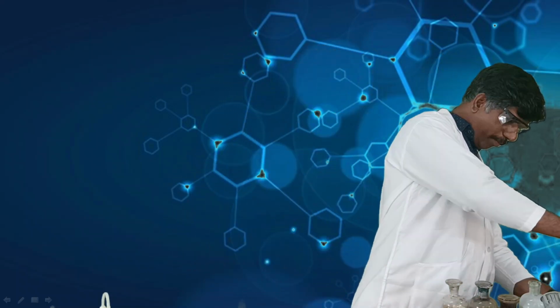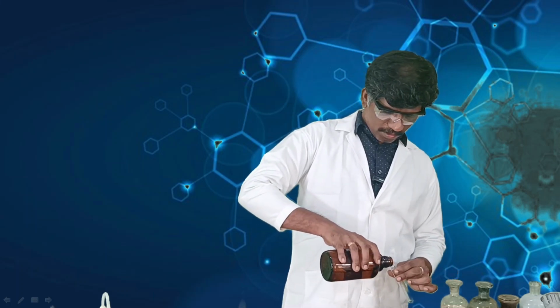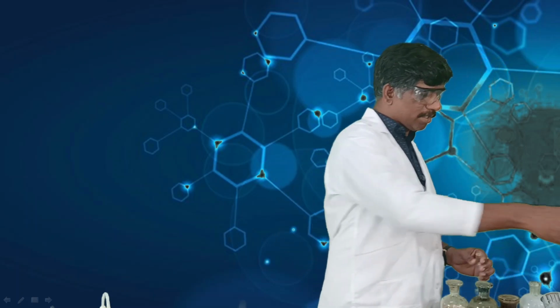If the compound is ketone, you have to do a test called Legal's test. If you do the Legal's test, you will get a positive result for ketone; aldehyde will not show a positive result for this test. You take a little amount of the given substance, and to this add sodium nitroprusside.